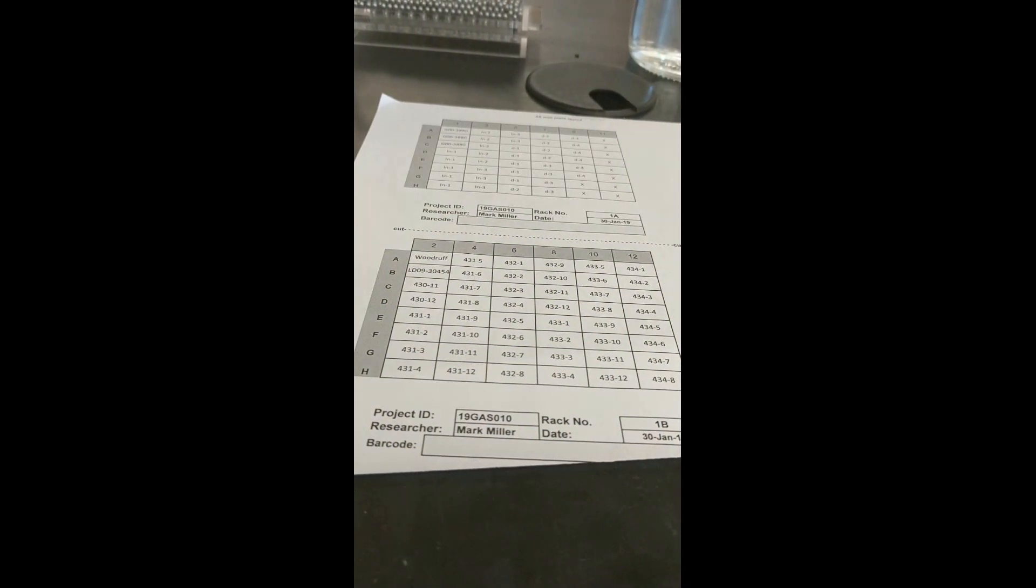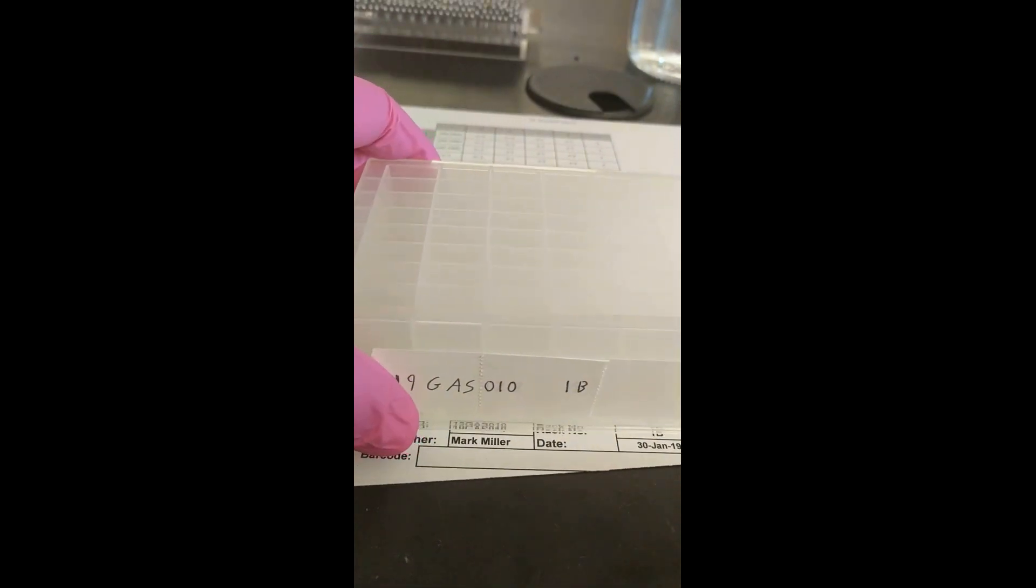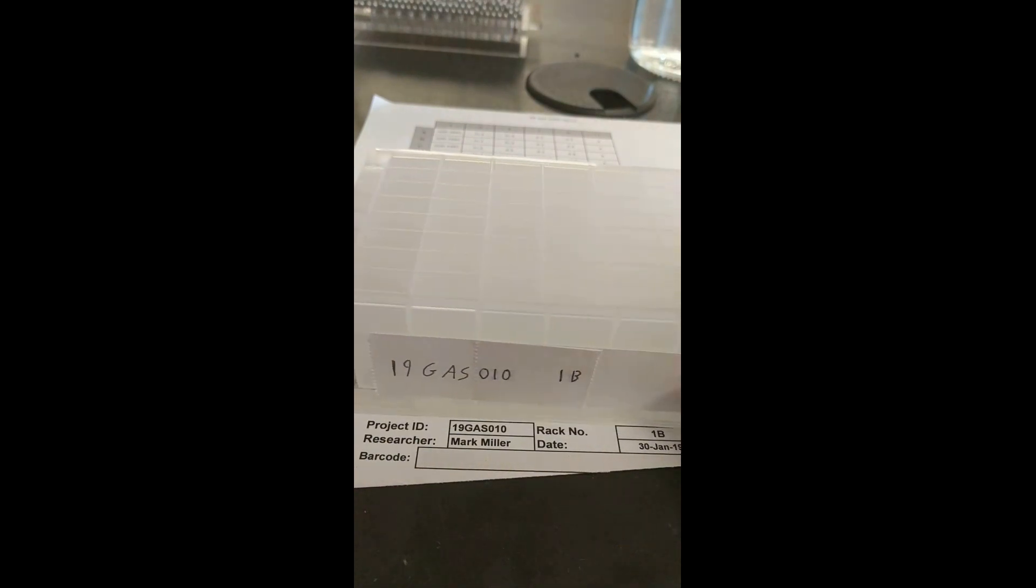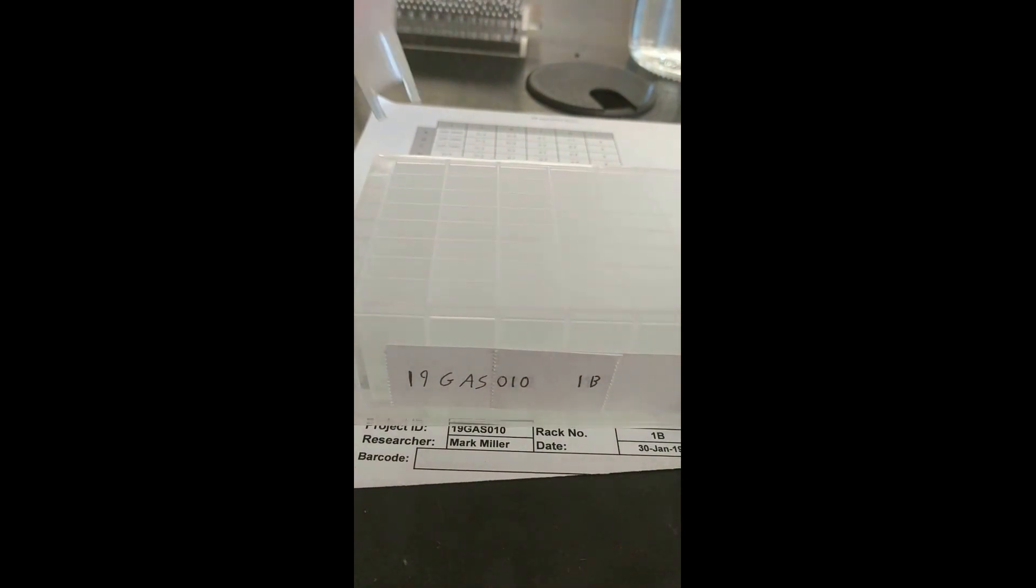First, we will take our planning diagram and put the 48-well plate upon it so that it lines up and we can see exactly what well we're looking at when we put the seed in. We will then proceed to fill each of the cells with five seeds.